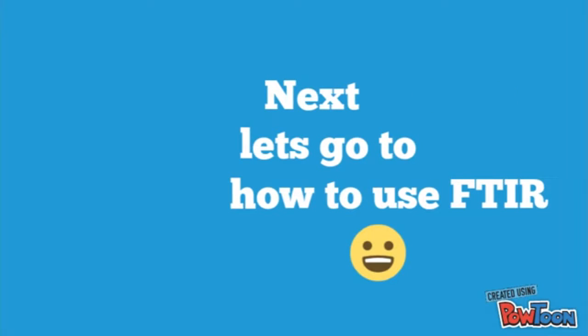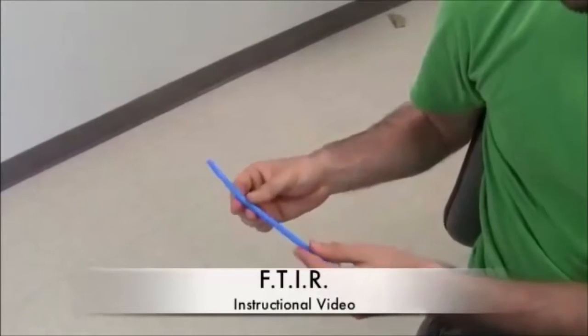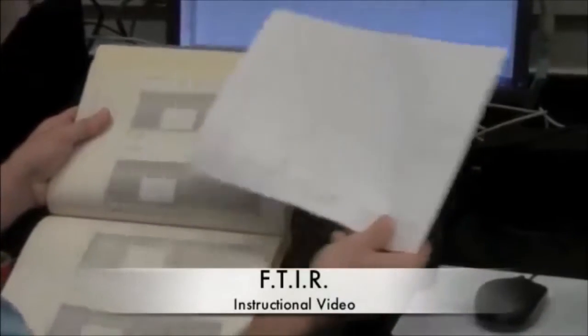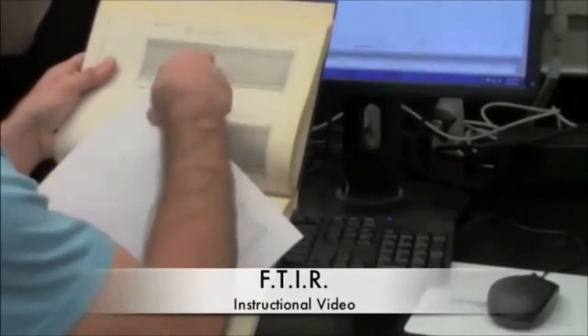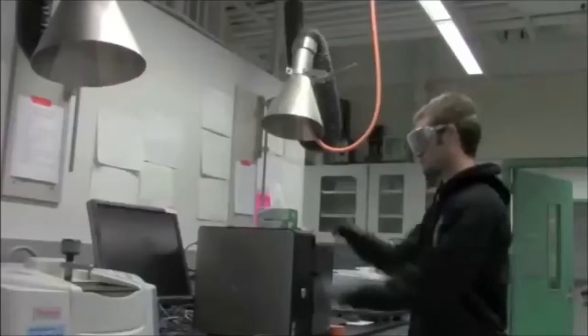How to use FTIR. FTIR is very useful for material characterization. They can be used to determine what functional groups are present in a material sample due to the fact that different functional groups absorb and transmit different wavelengths of light. They can also be used for quantitative analysis, for instance, analyzing the composition of two different copolymers.